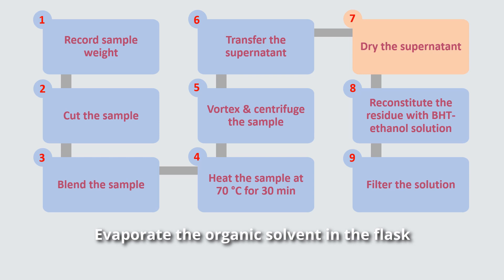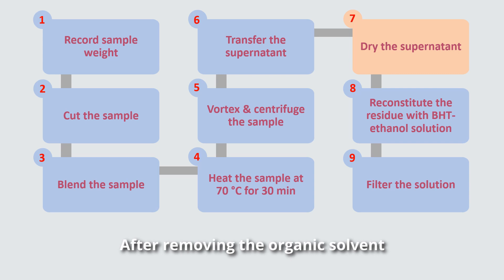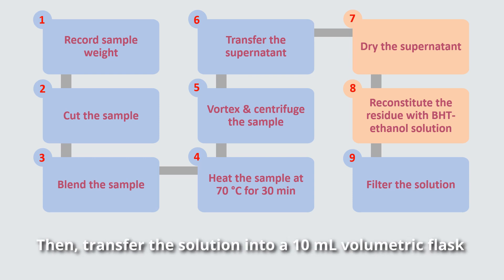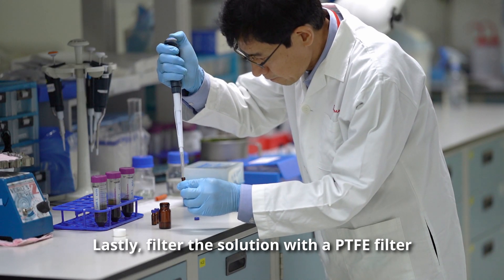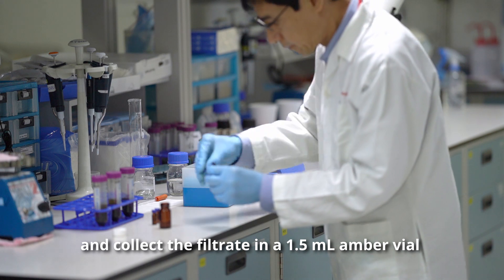Evaporate the organic solvent in the flask using a rotary evaporator. After removing the organic solvent, reconstitute the residue with BHT ethanol solution. Then transfer the solution into a 10 ml volumetric flask. Lastly, filter the solution with a PTFE filter and collect the filtrate in a 1.5 ml amber vial.